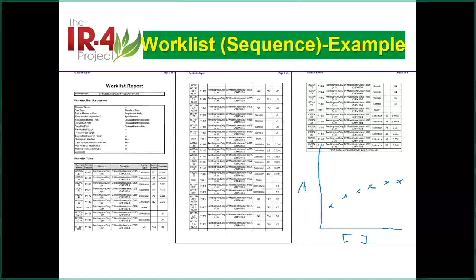And for set 2, we use a different color. That could be going down a little bit. So set 2 could go down here, go down here, go down here, like that. And it's the same concentration, of course. They are all the same concentrations. And you will see set 2, the line is like that. And set 1, the line is like that. That's happening all the time.